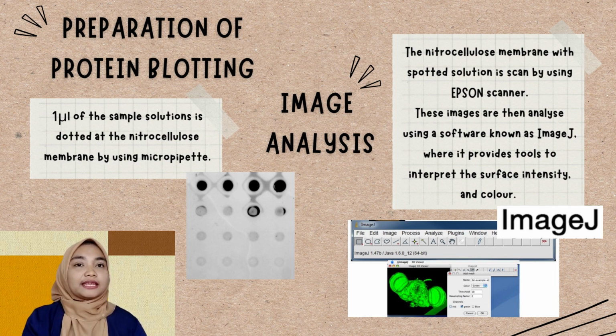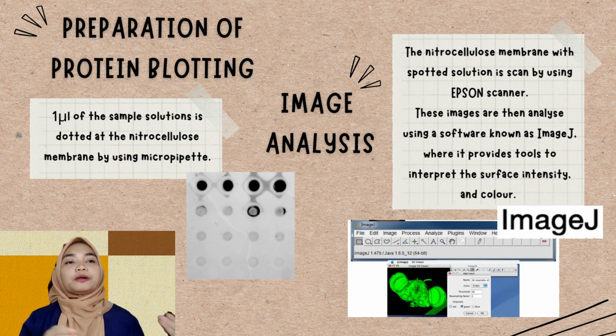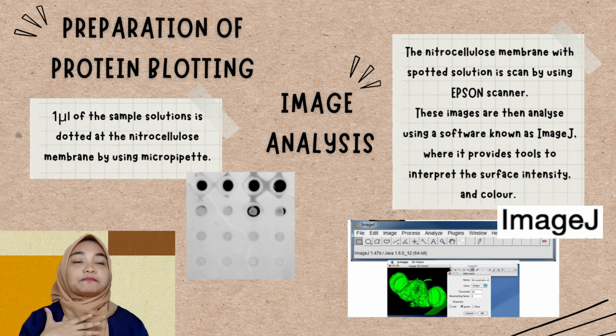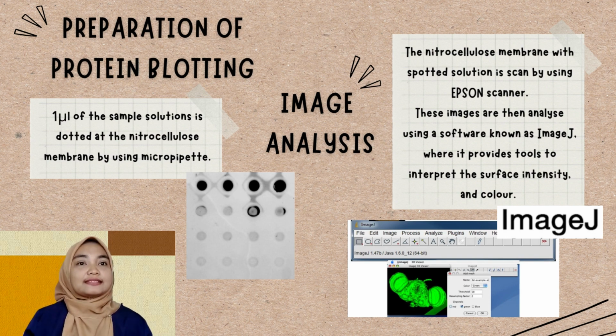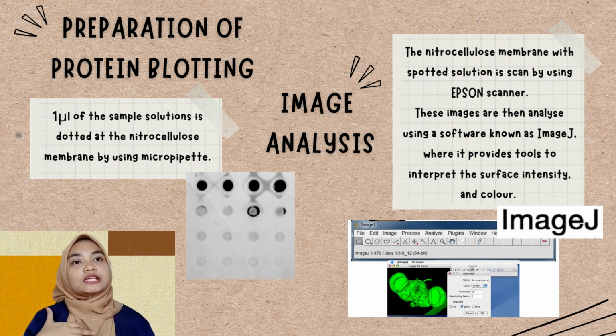The drop on the membrane is left to air dry for between 5 to 15 minutes for the interaction of the membrane with protein to occur. Then the membrane will be immersed in Ponceau S for a few minutes and the effect of the coffee ring starts to appear. We use Ponceau S in this study as a dye solution. After that, the membrane is rinsed with distilled water to remove any impurities and dried again at room temperature. The step is repeated and the result is compared at the 4 other manipulated temperatures.